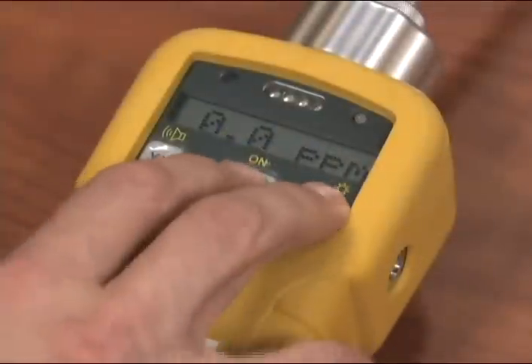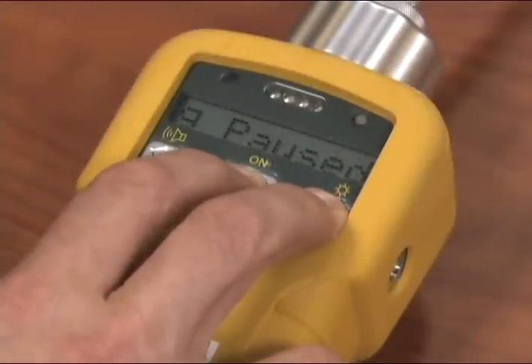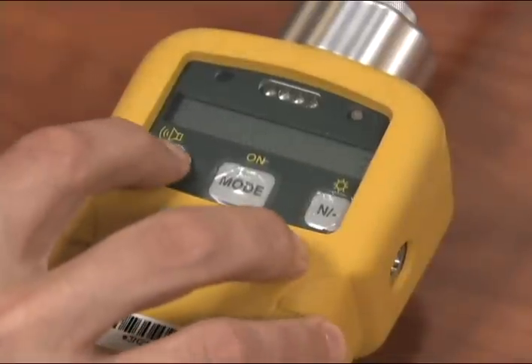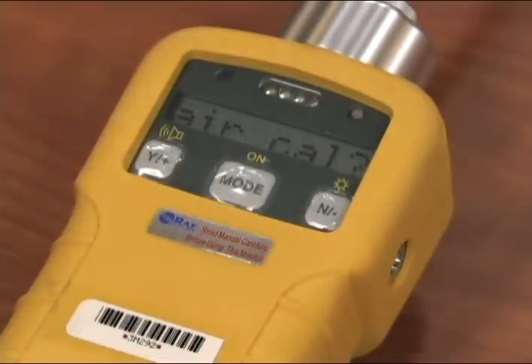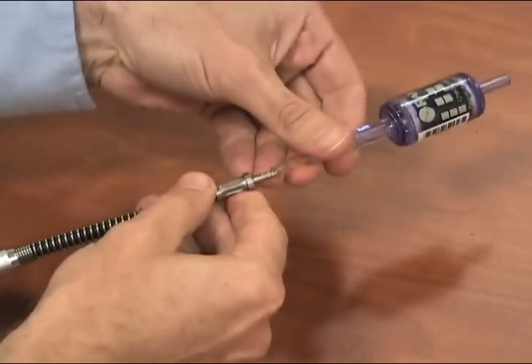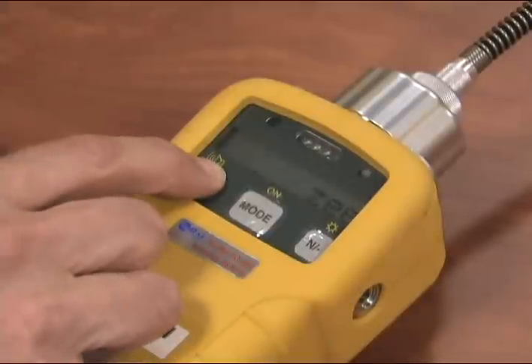To re-zero the instrument, press the mode button and the end button at the same time and hold until "data log paused" appears on the screen. This will stop the unit from data logging and the unit will ask you if you want to calibrate. Push the Y button. The unit will ask you if you want zero air calibration. Push the Y button again. The unit will begin zero air calibration while you install the zero carbon filter. Attach the zero carbon filter with the arrow pointing towards the unit and press Y. The unit is now re-zeroing.